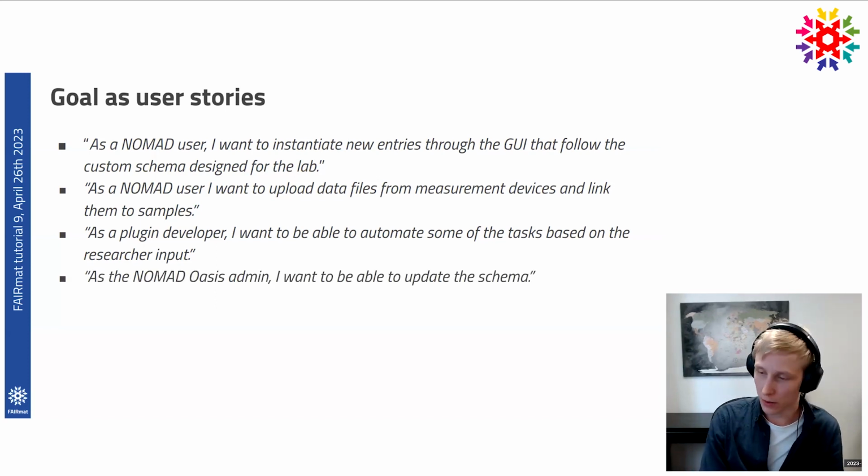And also the Oasis typically has an administrator as well, who is responsible for setting up the schema for the Oasis, installing it correctly, and also responsible for keeping it up to date. So these kinds of user stories you could come up with for this use case.